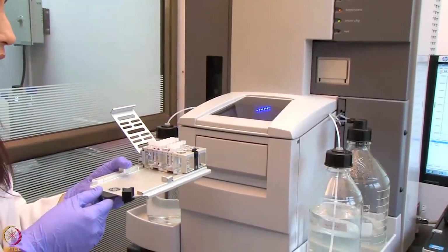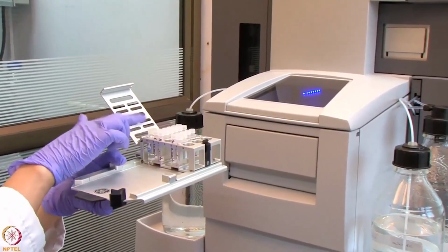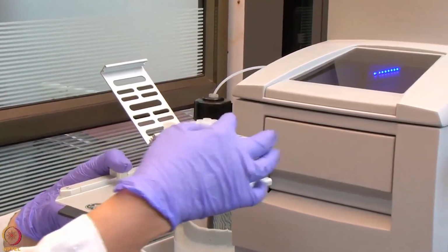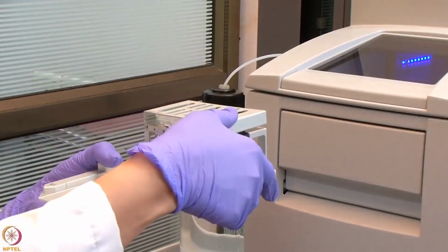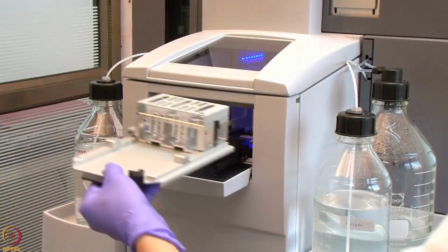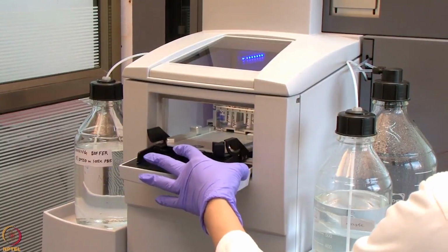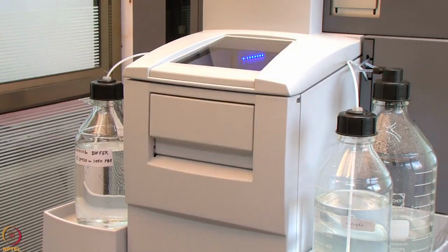We have now placed all our tubes inside the rack. We are placing this rack inside the system to start with our screening assay. We will now start with our run as demonstrated in the earlier lectures.